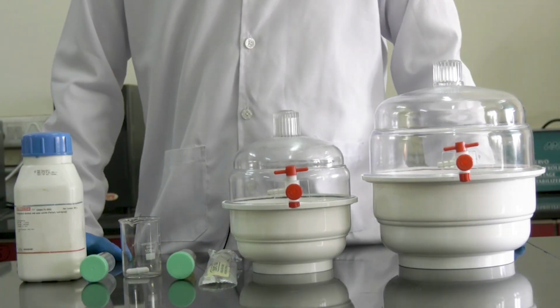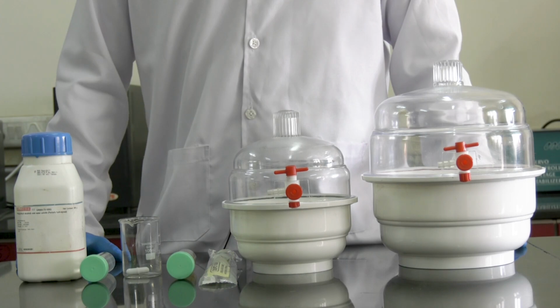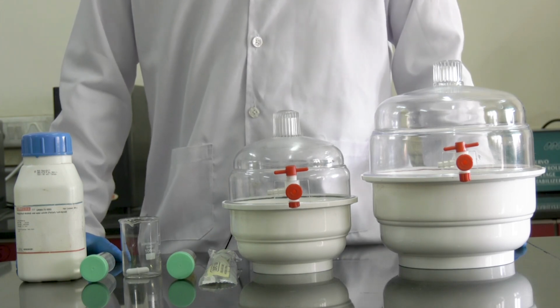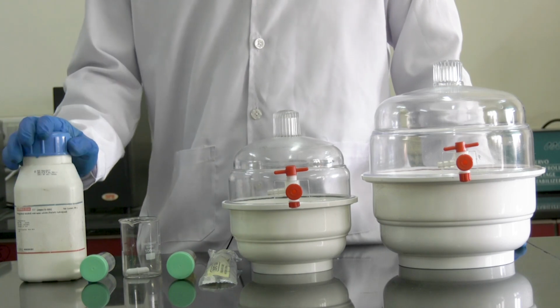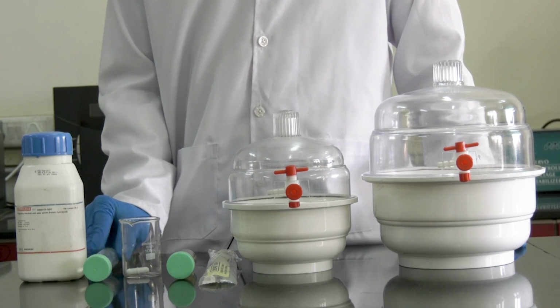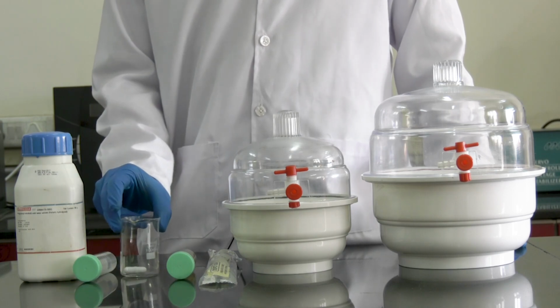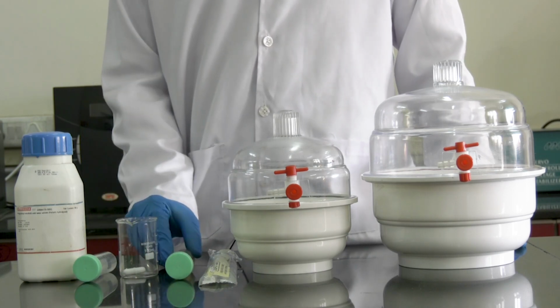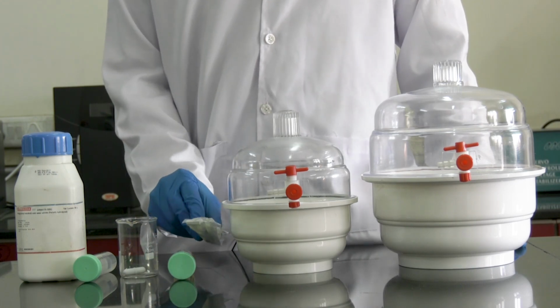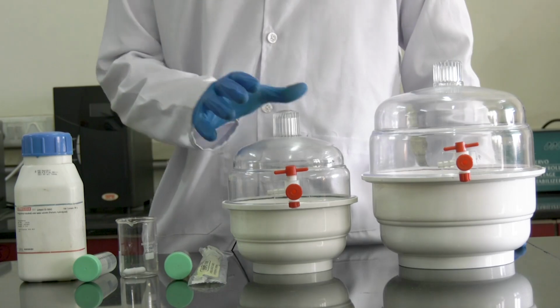In this experiment, we will learn how to fabricate nanofibers using an electrospinning instrument. For proceeding with the experiment, the materials required are polyvinyl alcohol as the polymer, ultra pure water, a beaker with a magnetic bead, glutaraldehyde as a cross-linking solution, a syringe, and a desiccator.